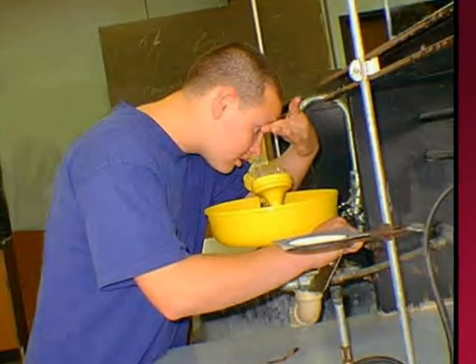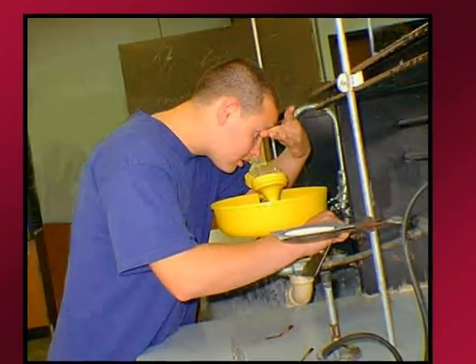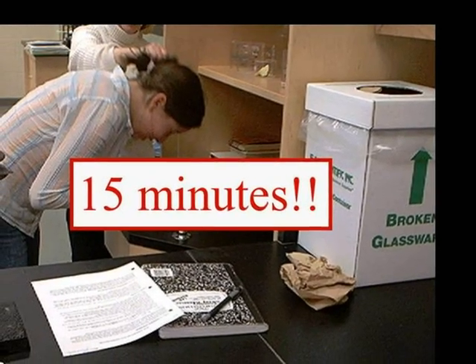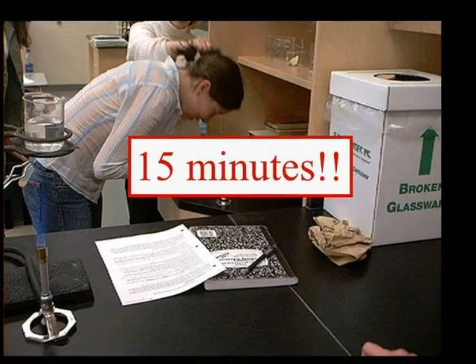If you get anything in your eye, notify me and then use the eye wash fountain for a good 5 minutes to flush out anything that might be in there. For some substances in your eye, you would need to remain in the eye wash fountain for a full 15 minutes.